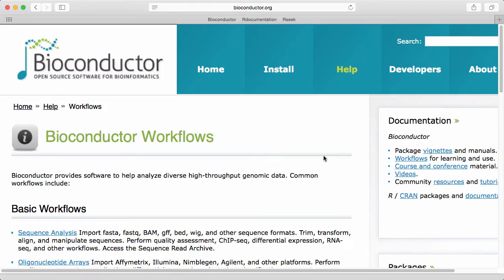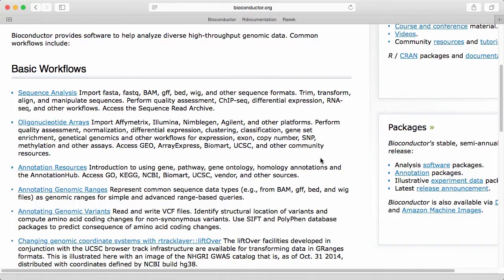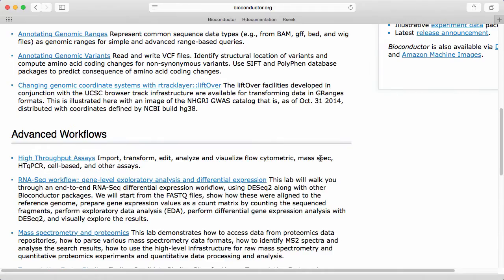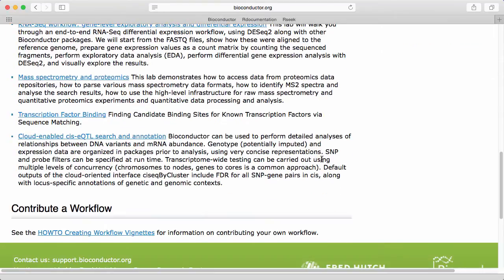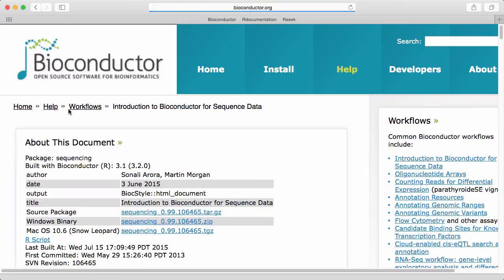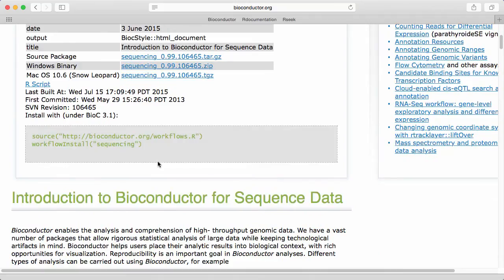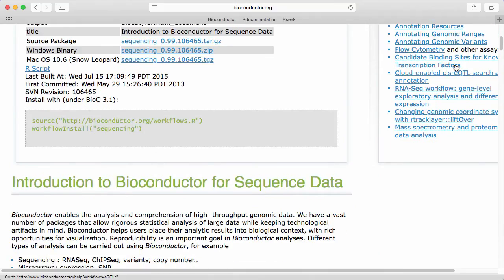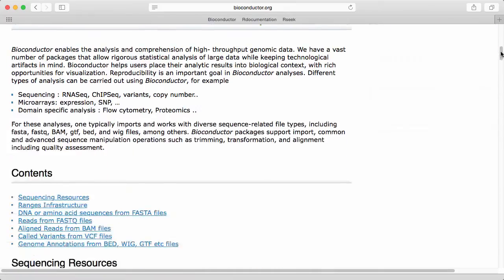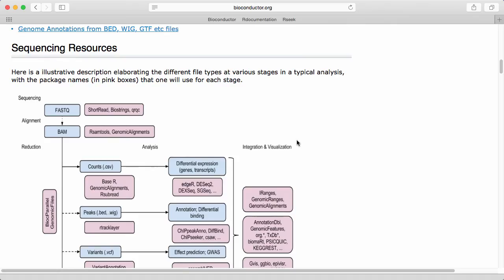Let's click on one of them and here we have a list of basic workflows, advanced workflows. Let's click on something like sequence analysis. And we get a document, in this case an HTML document.